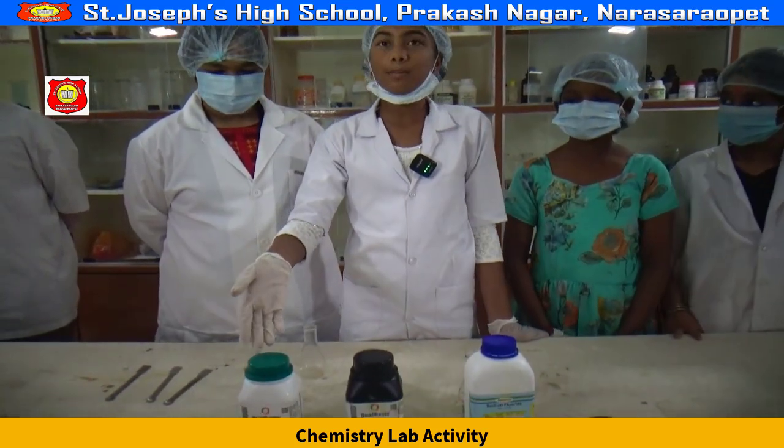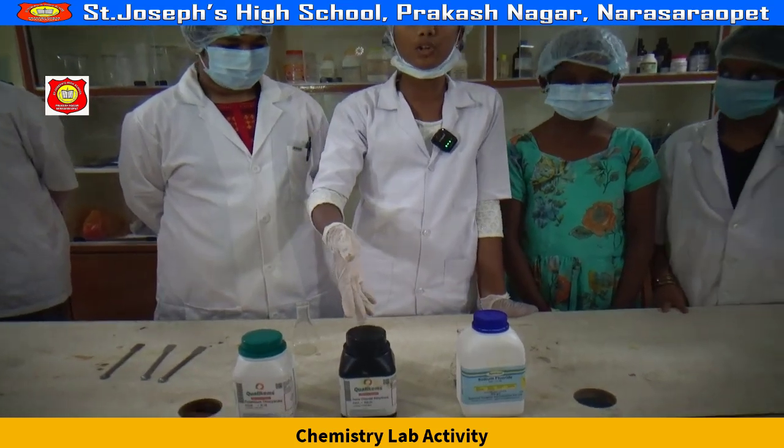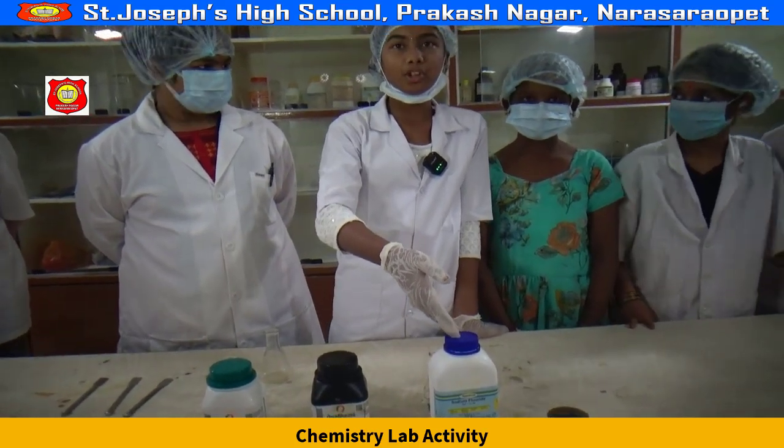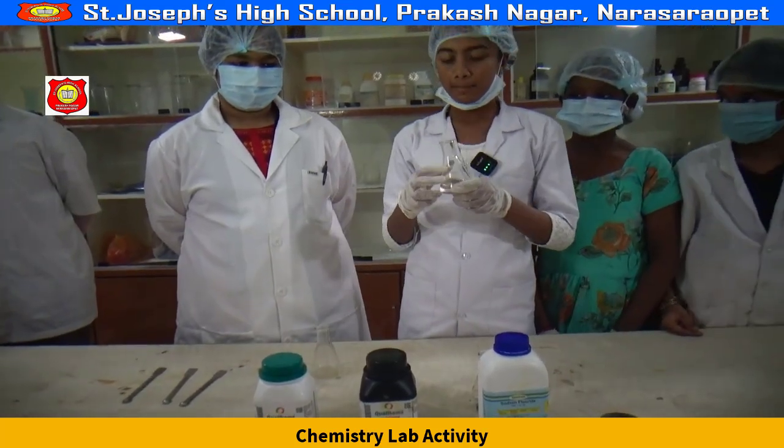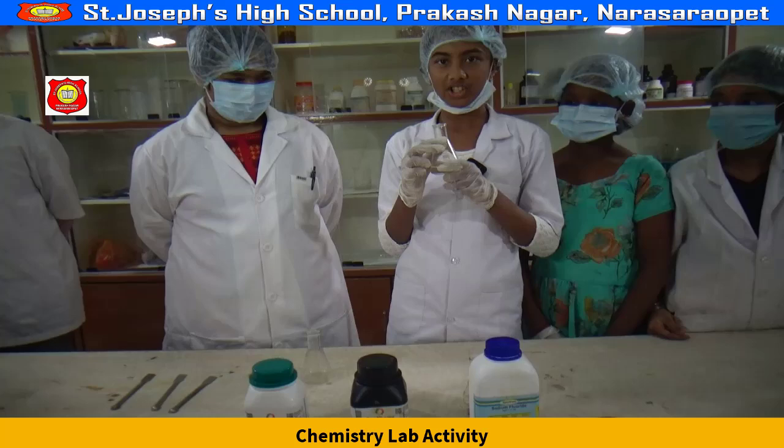This is potassium thiocyanate. This is ferric chloride. This is sodium fluoride. Now let's start the experiment. Take a conical flask which already contains distilled water.